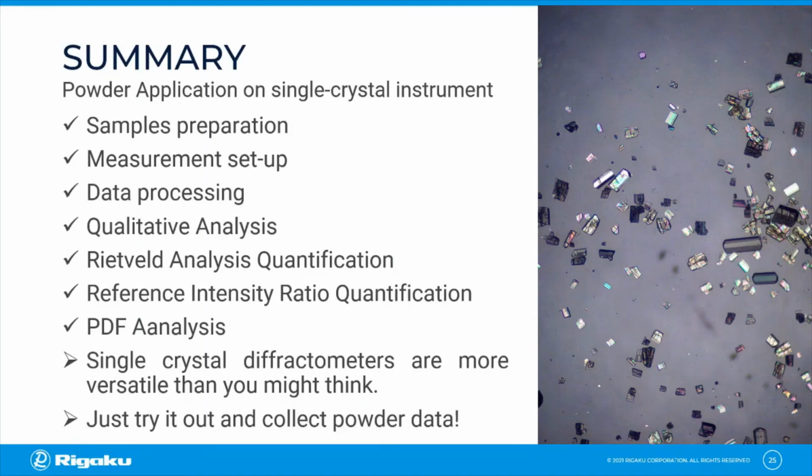And with that, I would like to do a quick summary of this lecture. I gave you an introduction to the sample preparation of powder samples for your single crystal diffractometer. You can mount samples either on a single crystal loop or in a capillary. Then you can set up a measurement either in CrysAlisPro or in your instrument control software. I showed you how you can process the data and extract the powder pattern.